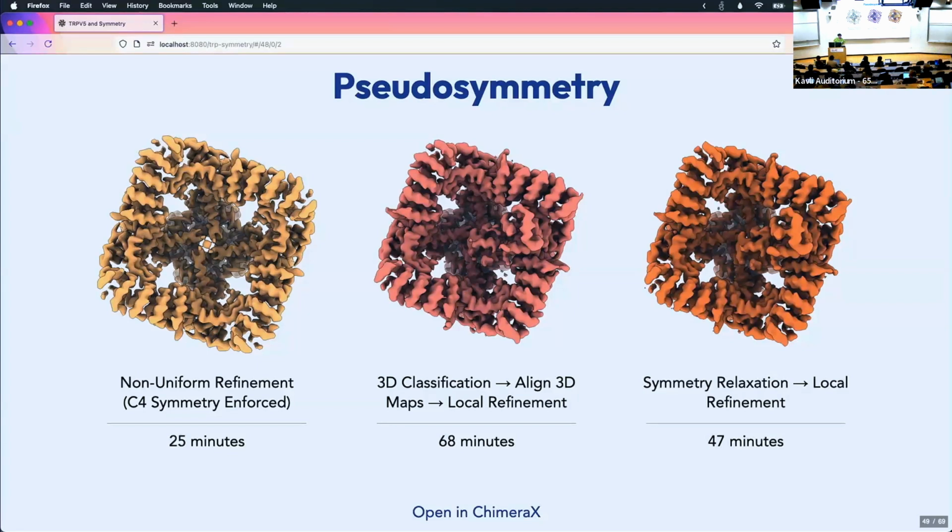So the two modes are complementary to how we do back projection in CryoSPARC in general. The homogeneous refinement job that Rich displayed earlier today just uses maximization. Totally aside from the question of symmetry, each particle is given a pose and then we back project it with just that pose. There is no smearing along different orientations.